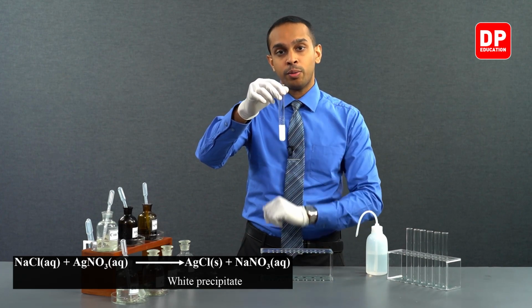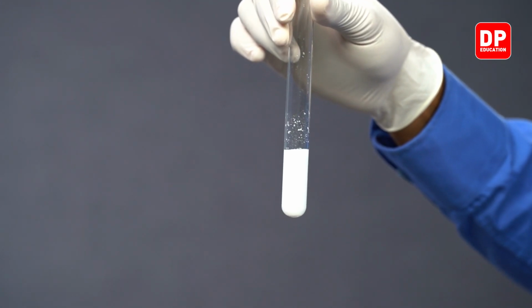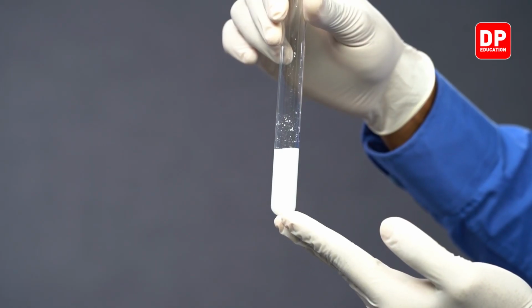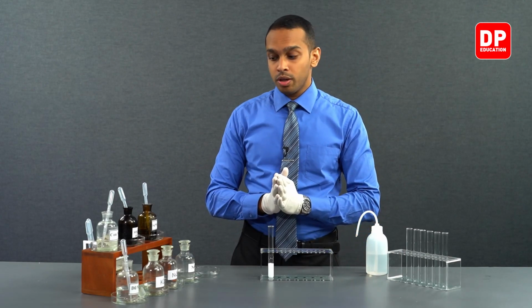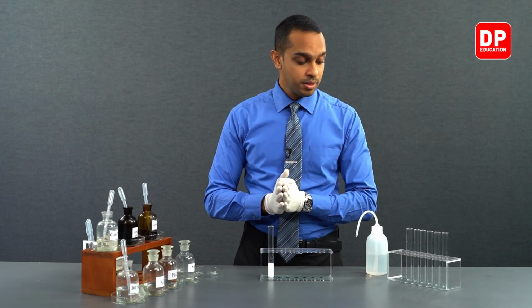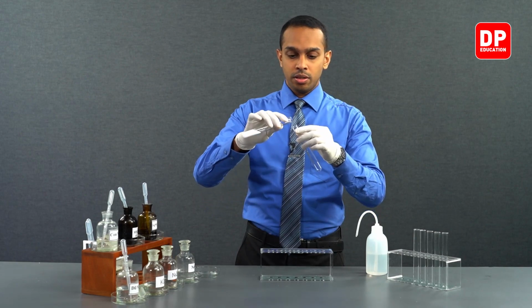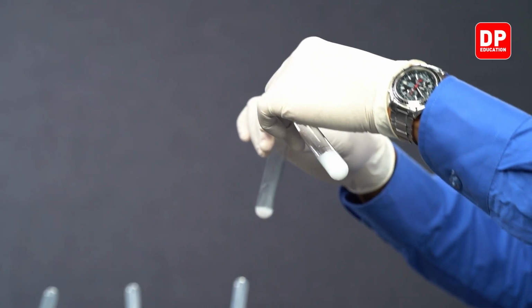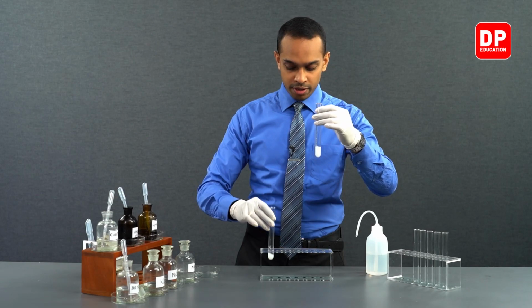This entire solution now appears white as a result of the formation of a fine precipitate that is silver chloride. If you let it stand for a while, you will see the precipitate sedimenting at the bottom, leaving the supernatant on the top. So this is silver chloride that is produced, which is white in color. Now we will take a portion of this silver chloride precipitate and transfer it into a different test tube. I'll be transferring a little bit of this silver chloride suspension into a different test tube.